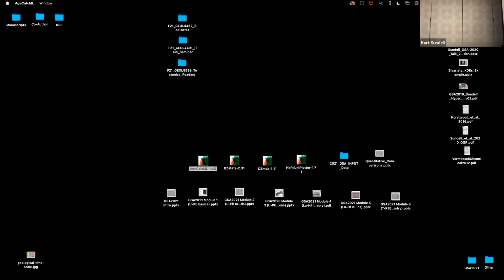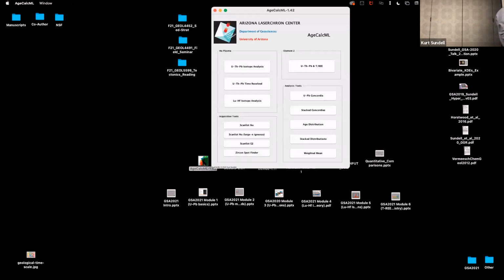These are deployed as individual graphical user interfaces, or GUIs, right? You can also run this stuff if you have a copy of MATLAB. You can always just run it from the code. You don't have to know anything about a command line interface or any coding interface. You don't need to know anything about coding to run this in MATLAB. So don't be afraid. I know I was afraid when I first started Googling how to plot things in MATLAB.